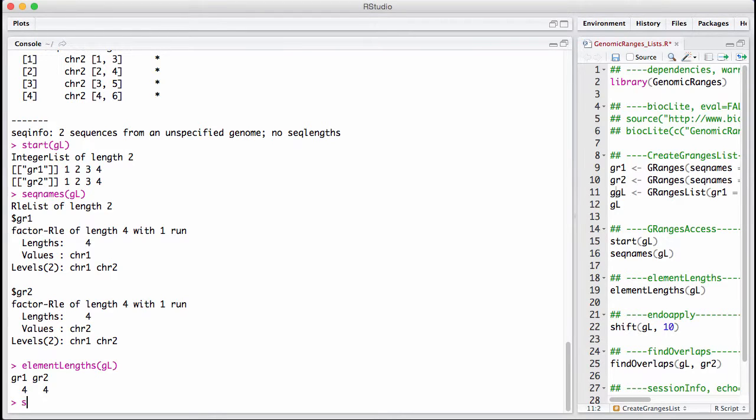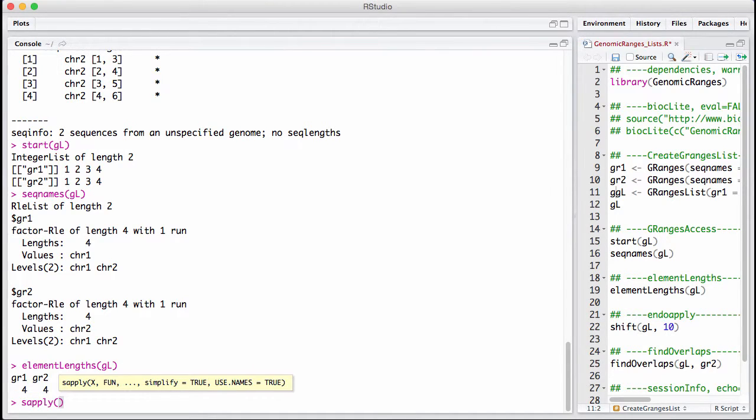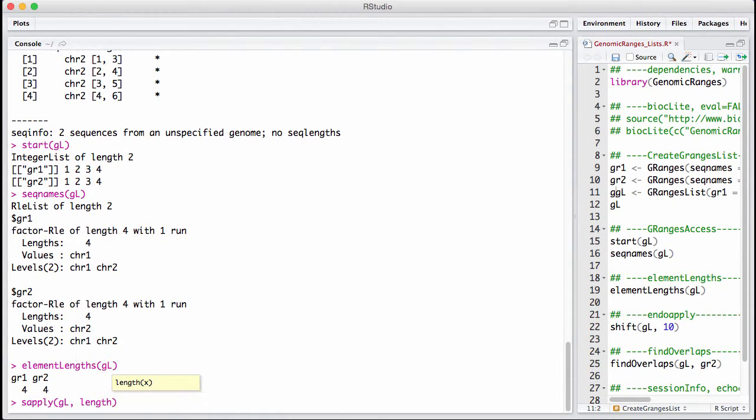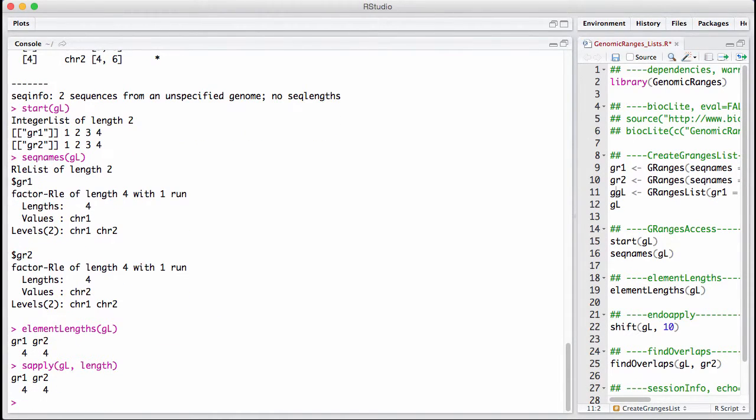It's much, much faster than doing, let's say, SApply length. You're not going to be able to see that because these are really pretty small objects. But for very, very big lists, there's a huge speed difference there.